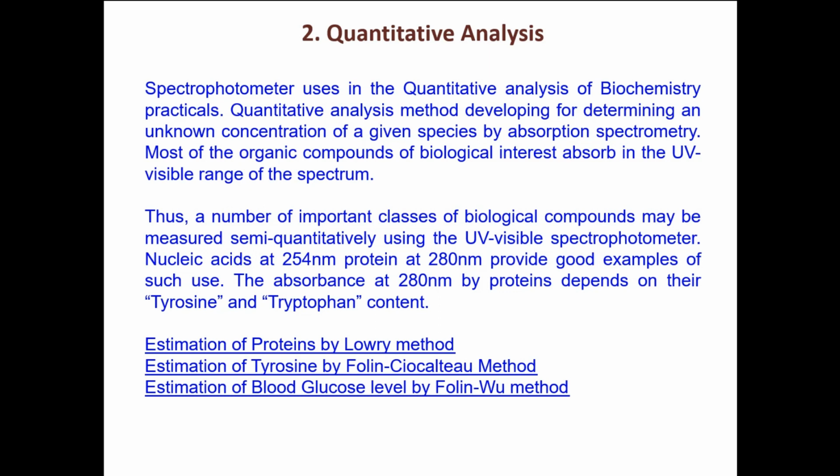Okay, so when I place a sample in a tube, the sample has lactate and NAD, and then lactate dehydrogenase is added. All the buffers are there in the tube. As and when I add the lactate dehydrogenase, the reaction will start, right? So I place the sample in the cuvette holder, and I get zero as the initial reading, when no reaction has started.